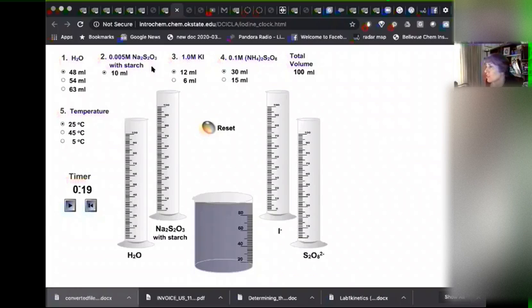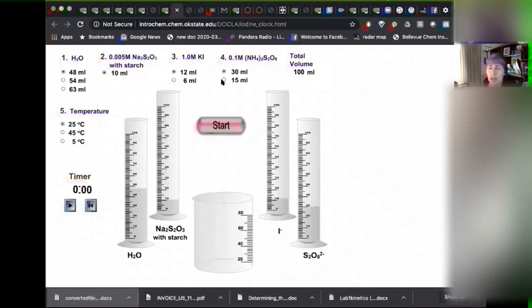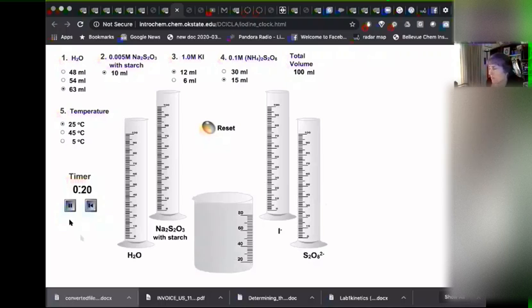But now I'm going to change how much. I'm going to reduce this by half. Now, if we were doing a truly virtual lab, you would write down that time and that would be your data. But I'm giving you data for our lab. So I reduced this by one half. And then I'm going to increase my volume of water. So I think it needs to go to here to give me 100 total. So in this simulation, we're using the same amount of reactant with starch on this side. We're only changing the other one. So what do you think is going to happen? Is it going to go faster or slower? Do we just want to watch? So I just click the timer right when it put it all together. And we reduce the concentration of one of the reactants. This is like trial six of our run. Oh, yeah. So look at that. I reduced the reaction by half, the reactant by one half. And I got almost double the time.